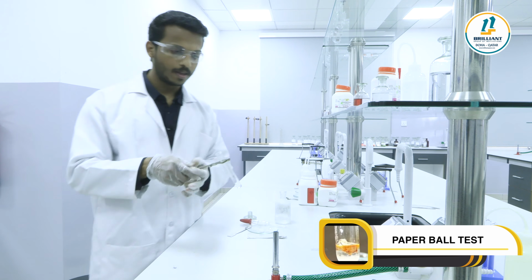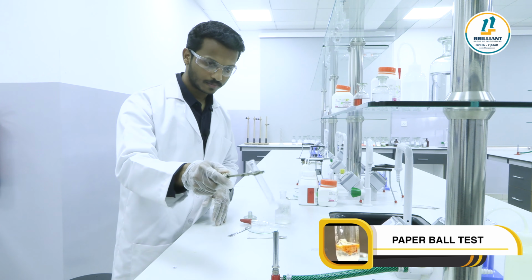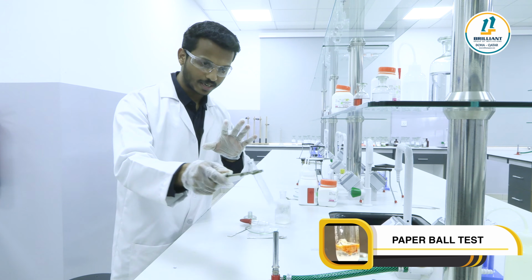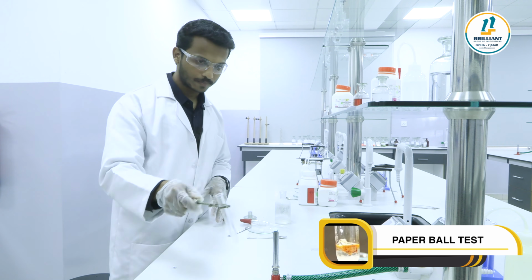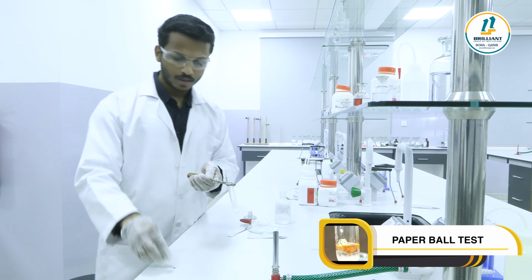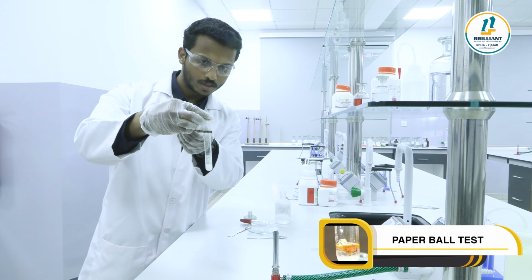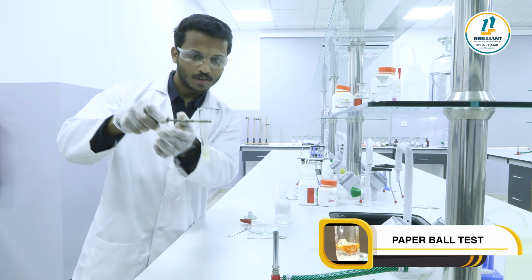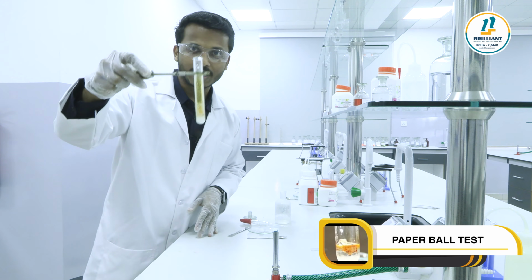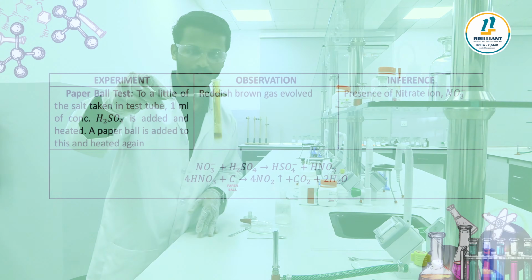Just keep it there. First, let me heat the solution. Only salt and concentrated H2SO4 is there. Heat it and add this small piece of paper into the solution. You can see reddish brown fumes, right? Reddish brown gas is generated.